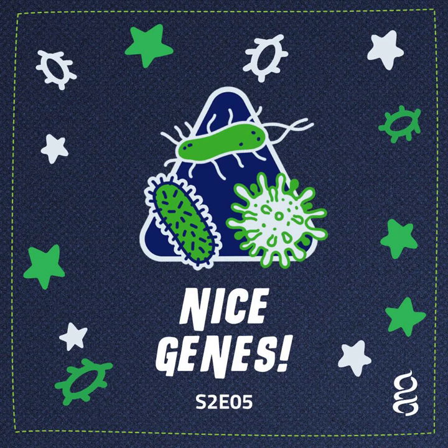And so we use chemicals to lyse the poo particles and all the other bio bits in the poop, and put it over a filter, a special filter, and we collect all the DNA out of it. And then we wash away all the stuff we're not interested in, the proteins, the carbohydrates, till we just have pure DNA. And from that nice, clean sample, scientists like Mike comb over it.